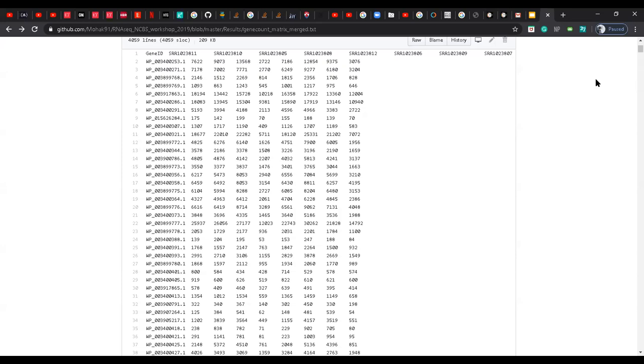After mapping, the only step that is now remaining, which Nitish will complete in the next class, is to assign wherever these reads are into particular bins. So for example, if there are 900 reads that map to your genome, how many of these then map to a particular gene?